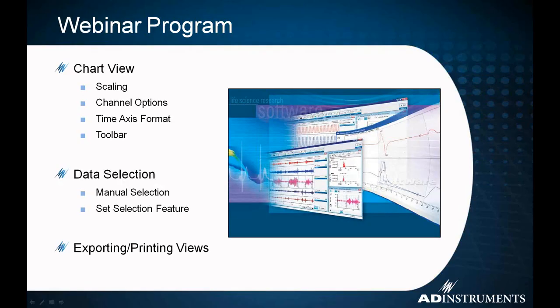So to get into the actual meat of the webinar here, this is what we're going to be talking about today. We're going to be talking a lot about the chart view. The chart view is your main area for recording, the view you most use in LabChart. And we're going to talk about how you modify that and change the way things look. So we'll talk about that quite a bit.